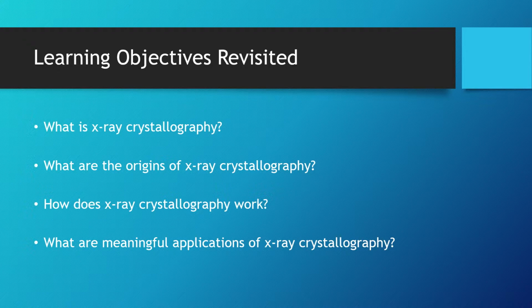It works by creating and focusing an X-ray, which passes as a beam through a suspended crystal, whose diffraction pattern is shown on a photographic plate behind it, and then its meaningful applications are through the imaging of large molecules that often have a substantial biomedical or biochemical use, usually enzymes.